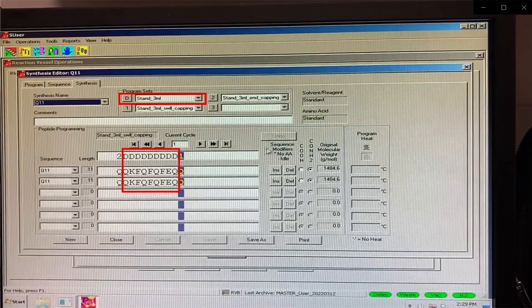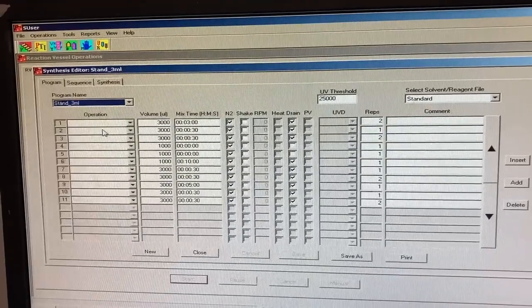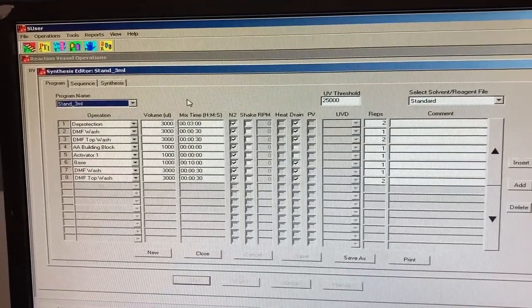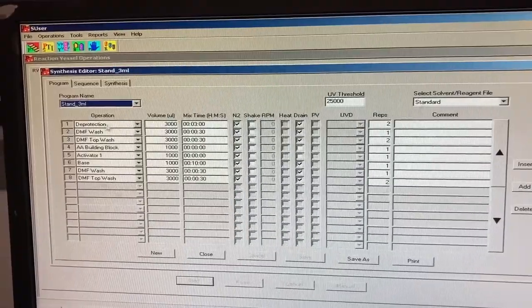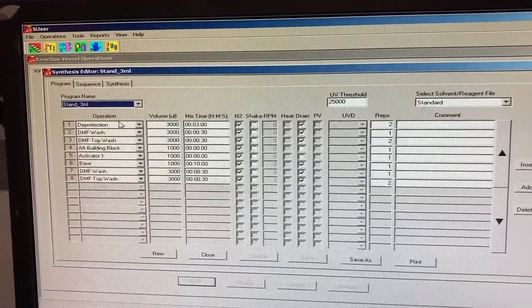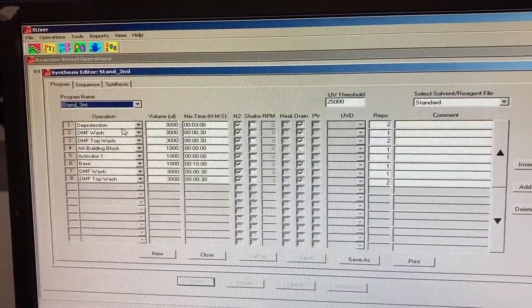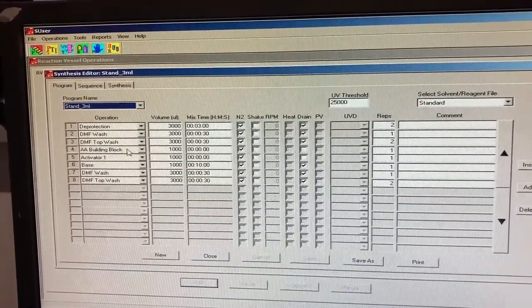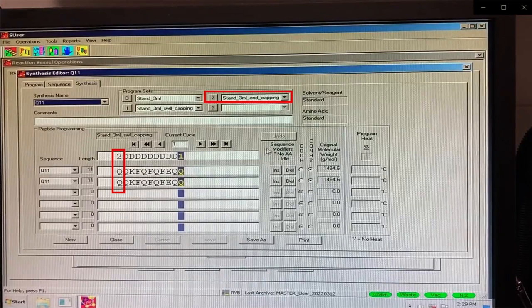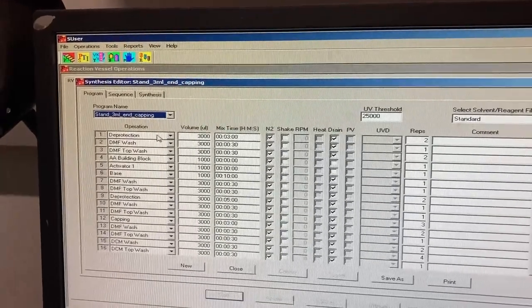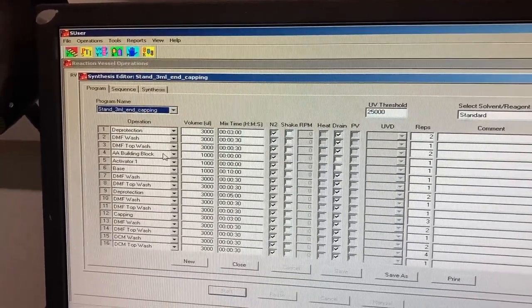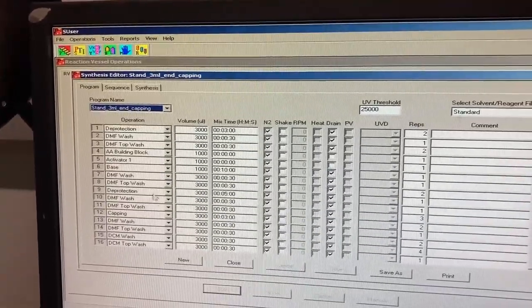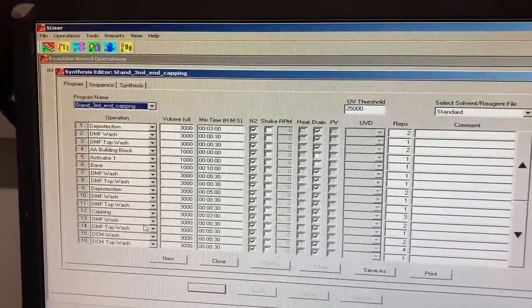The letter D corresponds to the program, Standard 3 mL, which is the coupling and deprotection of amino acids, so that it corresponds to all the amino acids between the C and N terminus. Lastly, the number 2 corresponds to the Standard 3 mL End Capping Program, where the final amino acid is coupled, deprotected, and the N terminus is capped.